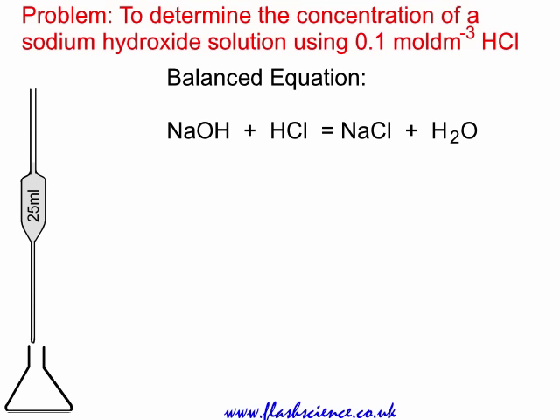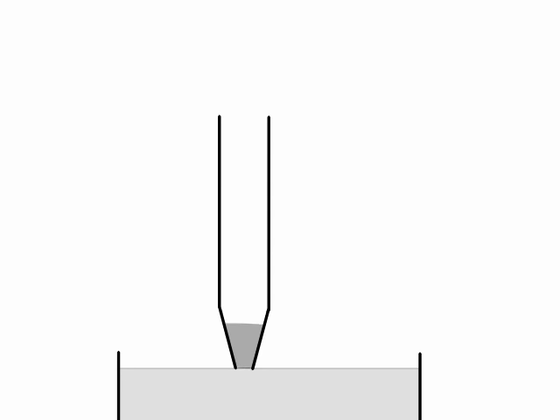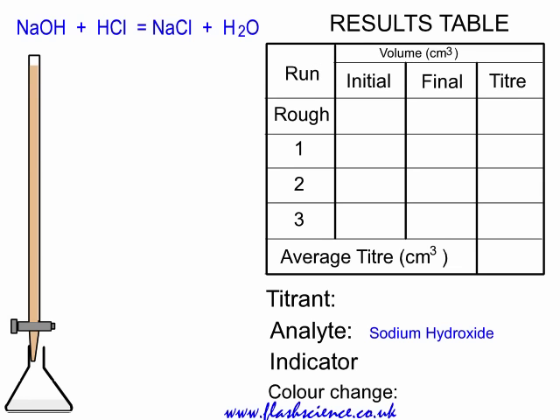What we do is take a bulb pipette — typically 25 cubic centimetres, or 25 mils. You can see the liquid being run out, not blown out, just run out under gravity into the flask. There will be a little bit left at the bottom of the bulb pipette. When you touch the surface of the liquid in the flask, by capillary action roughly half of that is withdrawn. A little bit still remains, and that's to be left — it has been taken into consideration during the calibration of the bulb pipette.